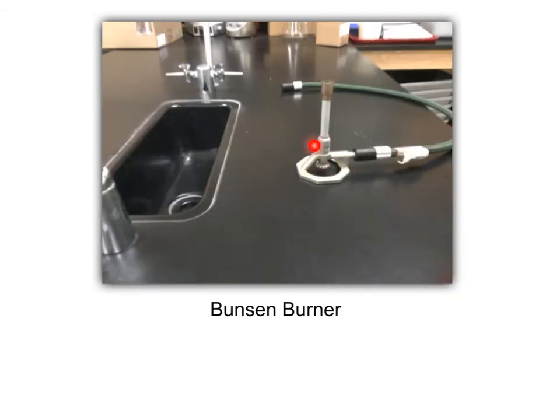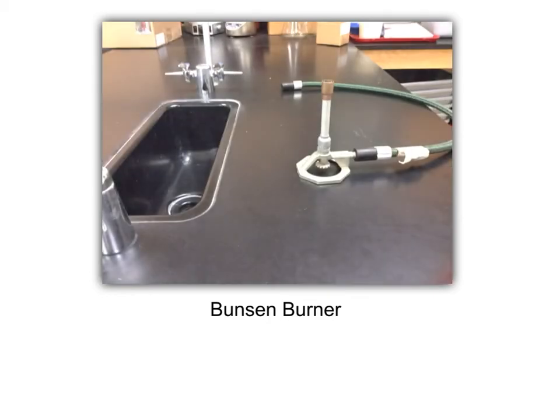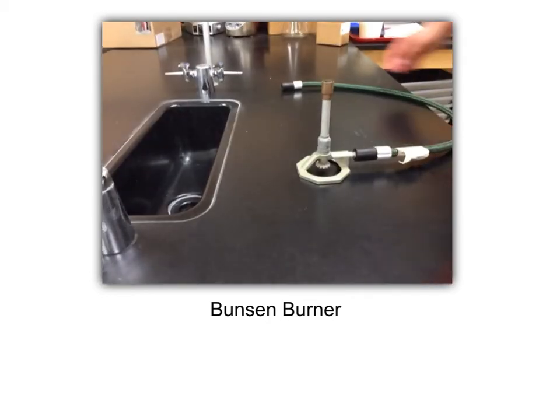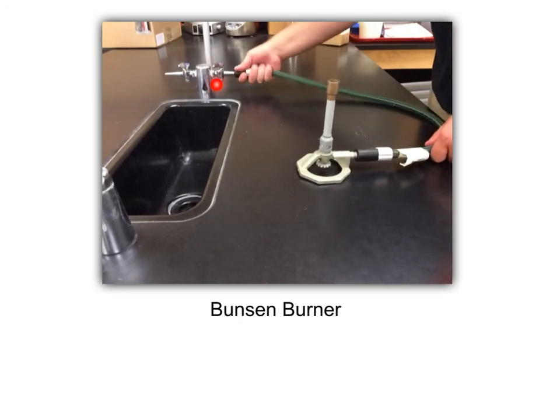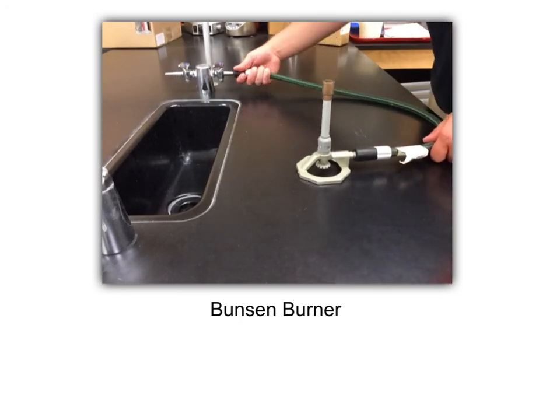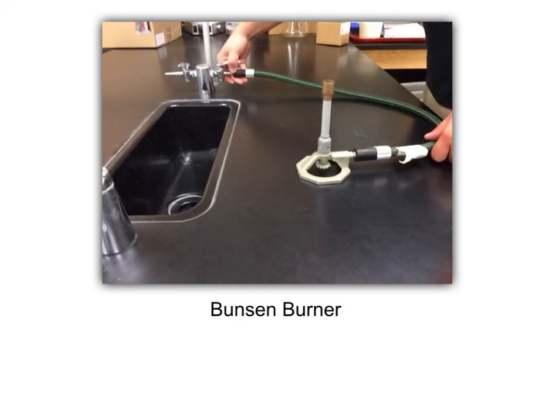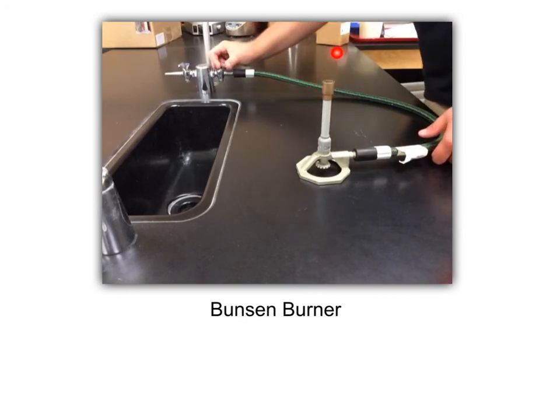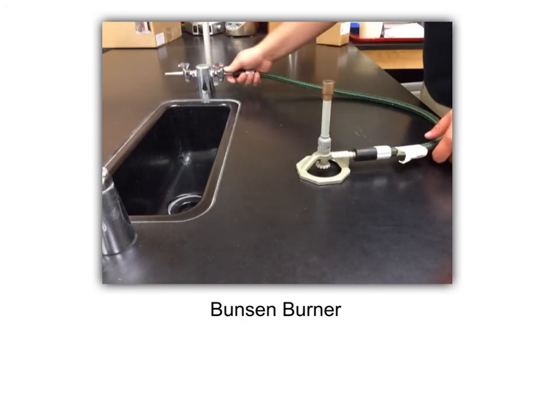This is a Bunsen burner. Its function is to provide us with a controlled flame — the important piece is that it's controlled. You plug it into the gas, turn the gas on, and use the igniter to ignite it, giving you a very stable, controlled flame.